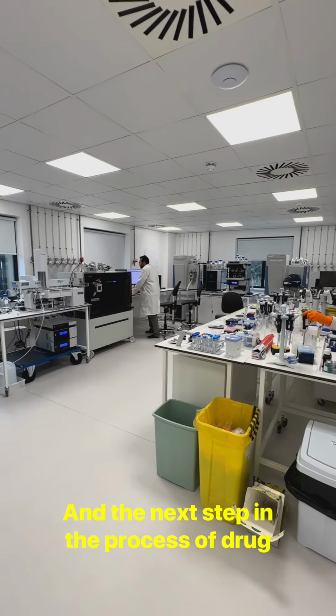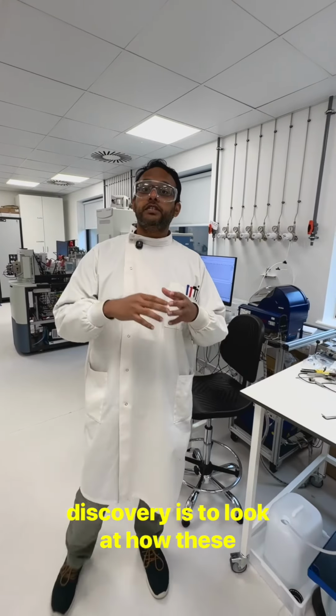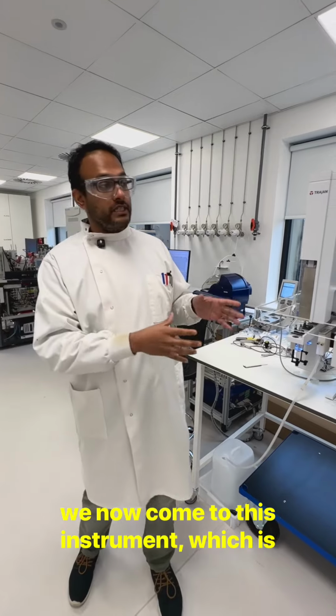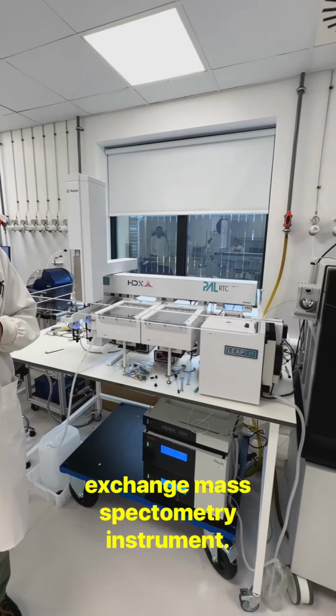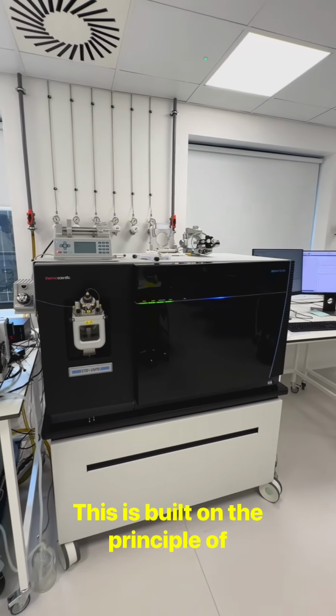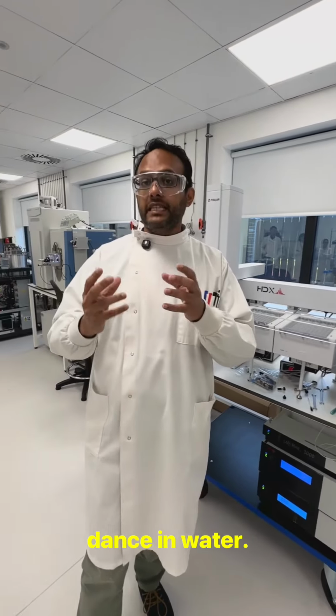compounds. And the next step in the process of drug discovery is to look at how these complexes move. And for that, we now come to this instrument, which is called a hydrogen deuterium exchange mass spectrometry instrument. This is built on the principle of understanding how these complexes move and dance in water.